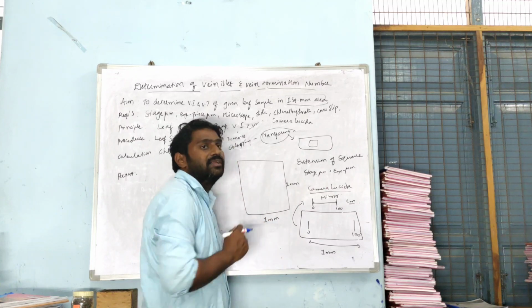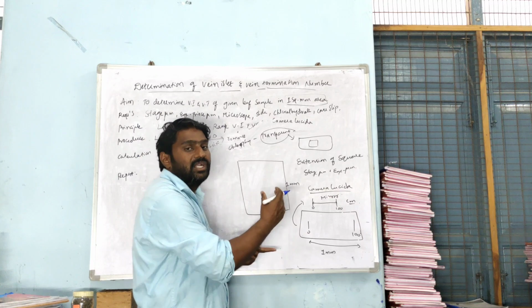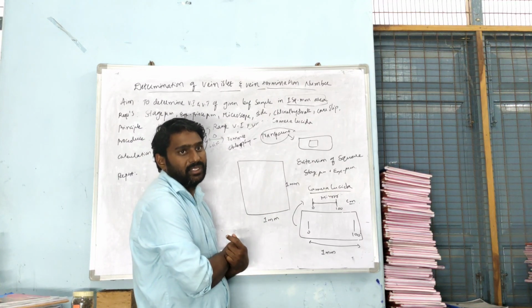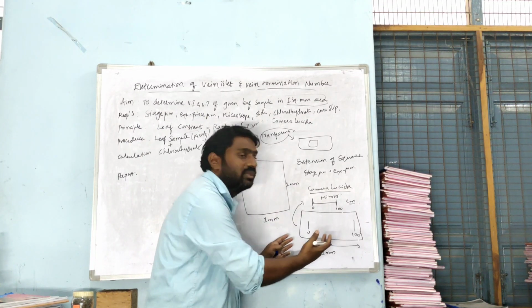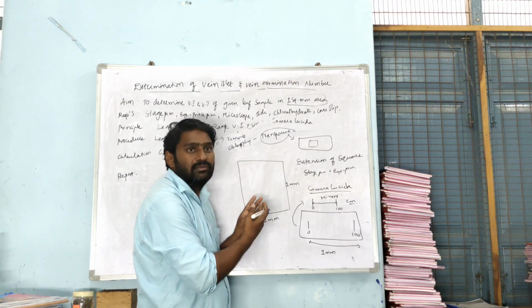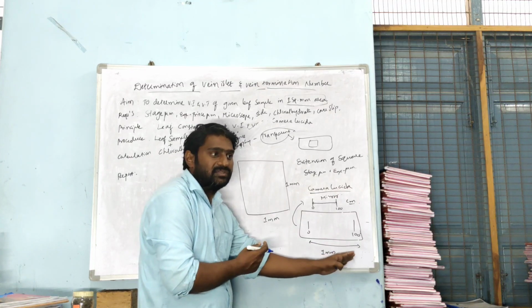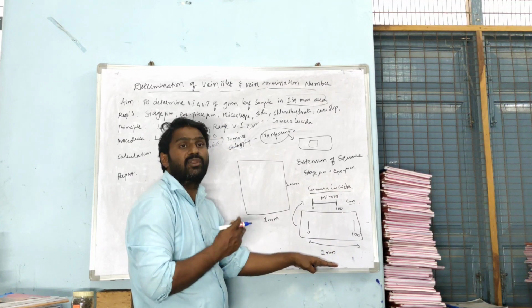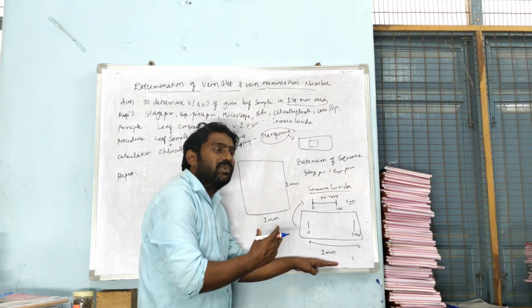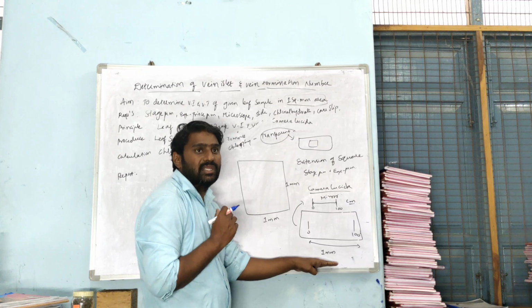So as you get it in centimeters, the same can be drawn on a black chart which is related to 1 millimeter area. Right? So we are not manipulating anything here. The stage micrometer is divided into 100 divisions, and these 100 divisions are equal to 1 millimeter. The same micrometer scale is traced onto a paper by using a camera lucida.